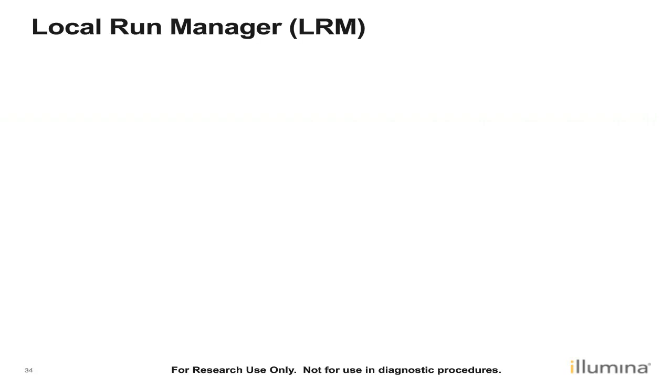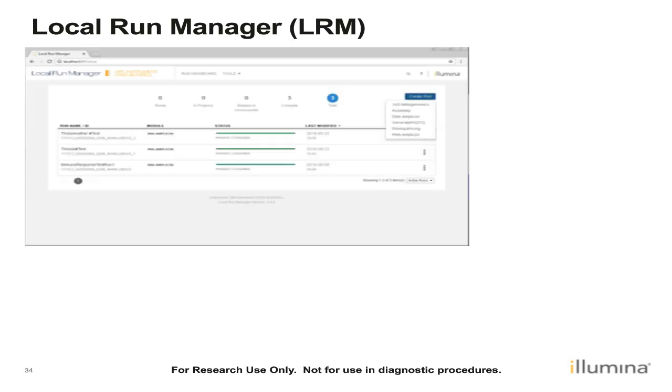So our first solution is Local Run Manager, and this is what the dashboard looks like. Local Run Manager is appropriate for our benchtop sequencers. So this is going to be the iSeq, the MiniSeq, the MiSeq, and the NextSeq. And this has a modularized approach, meaning that whenever there's a new module or a new application that you can try, you can just install the module and you don't have to install the entire framework.